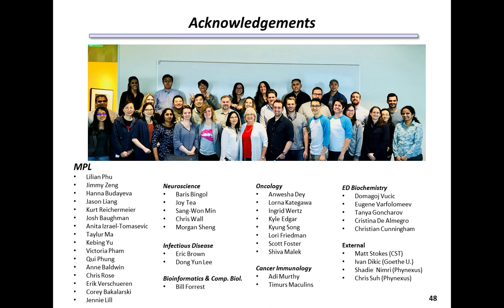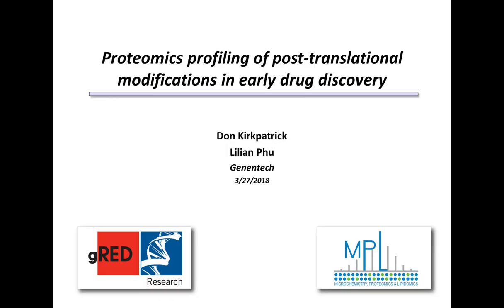Other modifications like acetyl-lysine, we've had really nice data from that down to 100 or 200 micrograms of total protein, and you're still seeing hundreds to thousands of acetylation sites. I'd also say that there are other options for when quantities of material are really limiting. So total proteomics can take anywhere from 100 micrograms down to just a couple micrograms to get that data. And IMAC, the metal affinity enrichment for serine threonine phosphorylation, 500 micrograms is plenty for that.